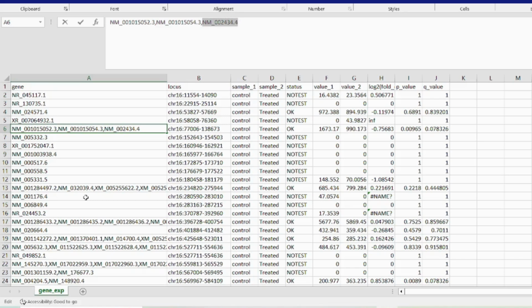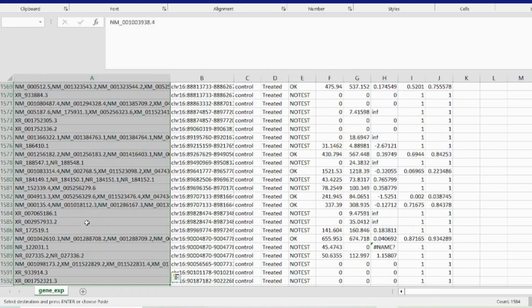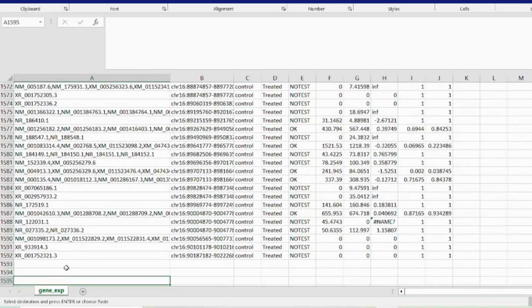For the discard I will show you, but just consider what if it is showing different IDs. At that time, how can you keep them? Then you just have to copy this complete row and paste it below. In case it is showing different IDs, at that time I'm just showing you, and here I'm pasting it 2 times.